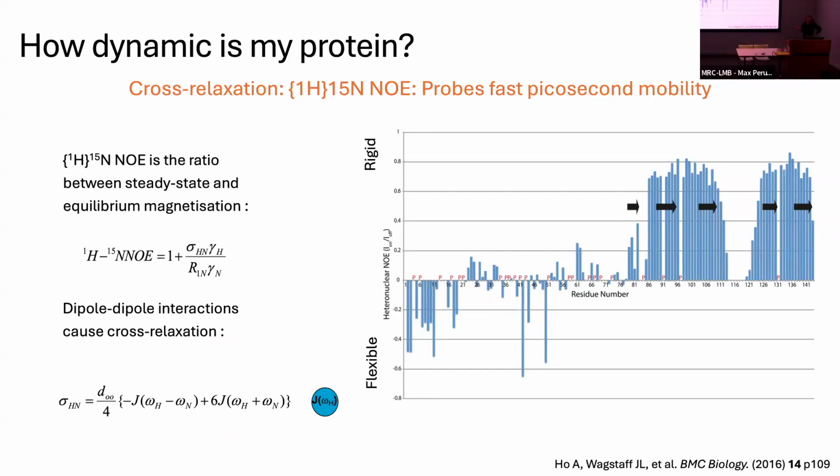What I think is really cool about this protein is that even though you have an unstructured N-terminus, you have these little islands of increased rigidity in that disordered part. We know that these residues are involved in ligand binding. So even though you think you've got a disordered N-terminus, there are parts of that disorder that are experiencing segmental motion that are important for downstream binding.